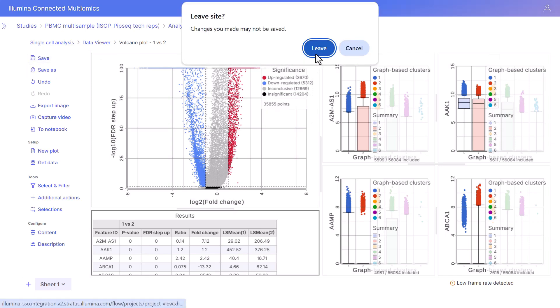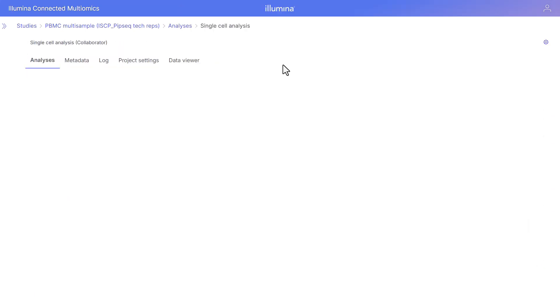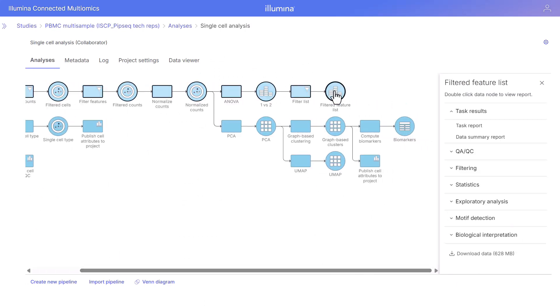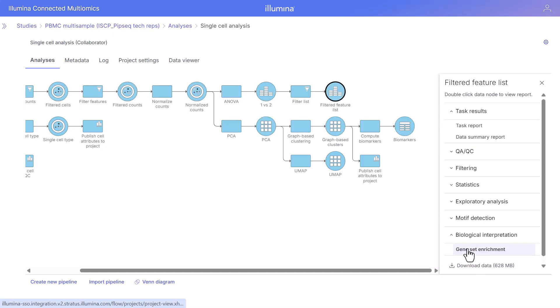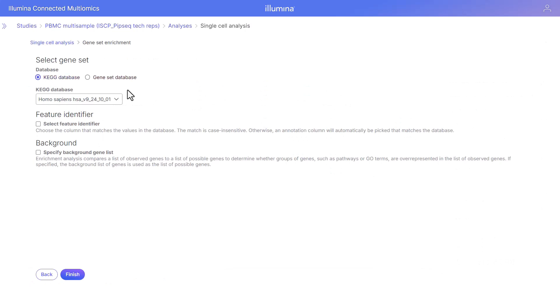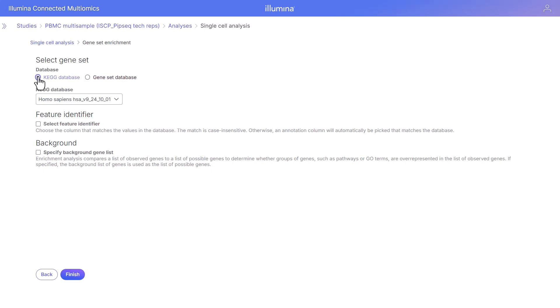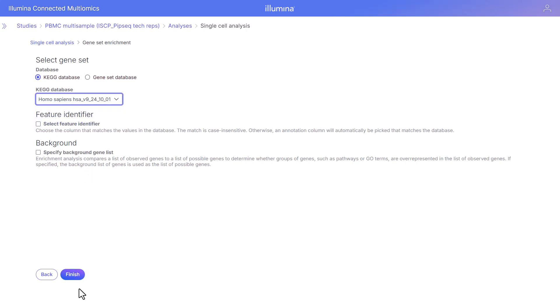Let's go back to the analysis pipeline. Here we see our filtered feature list. From this list, we want to perform biological interpretation via gene set enrichment. We can do KEGG pathway enrichment or gene ontology enrichment, or even specify our own gene set database. For the purpose of this demonstration, we're going to use the KEGG pathway database, keep the default database, and click finish. Our KEGG pathway enrichment has completed.